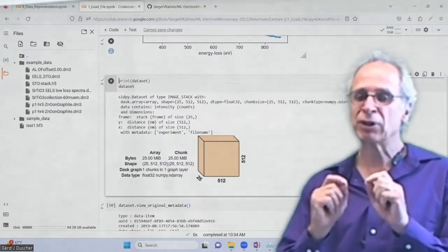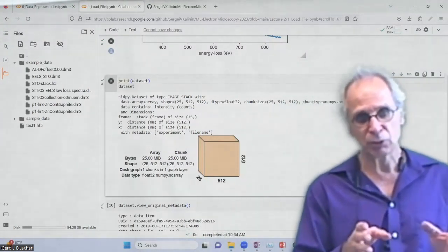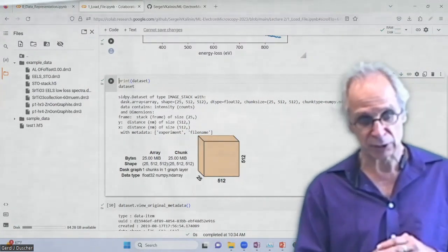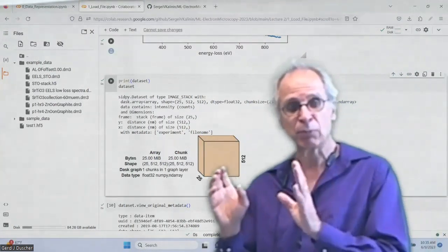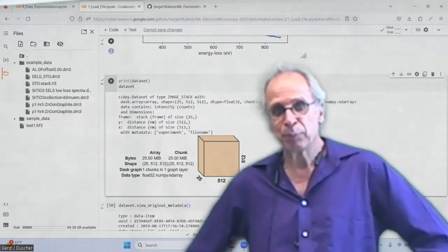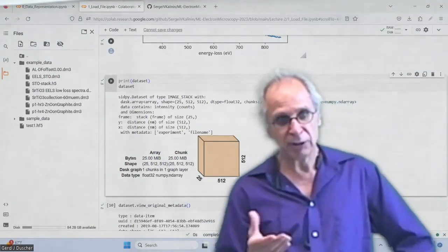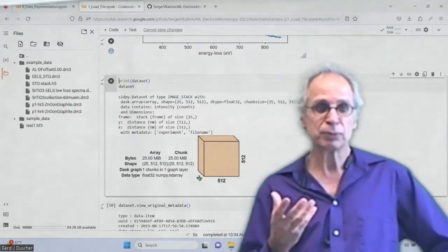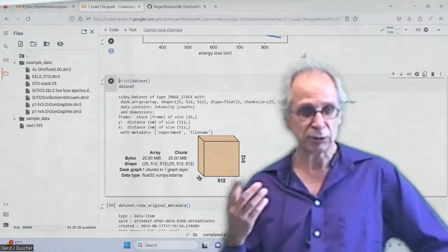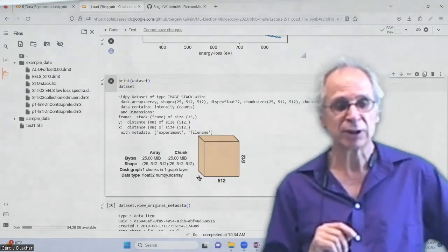If we want to do something very specific, we have to make a specific name, and it should only be used in that specific code cell, so that we can only change it at some point in the notebook and not anywhere else. So in microscopy, we try to use the philosophy of clean code. You can look it up. Python clean code will get you to various blog entries.